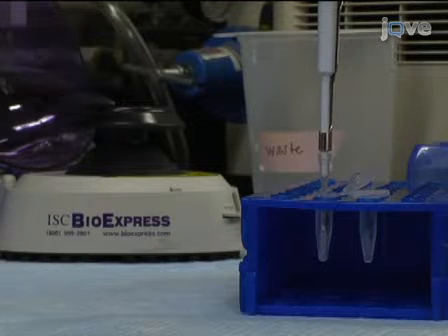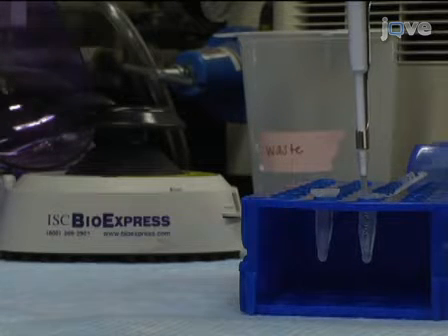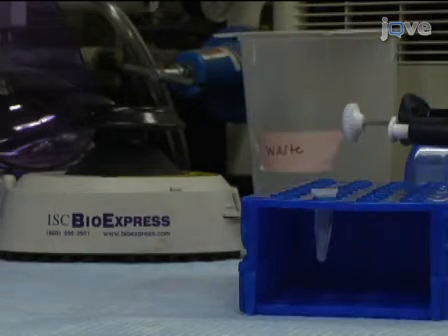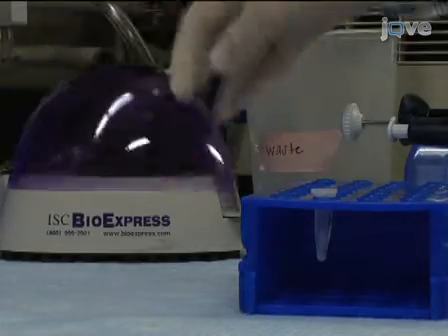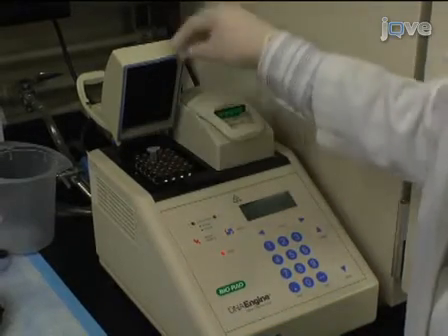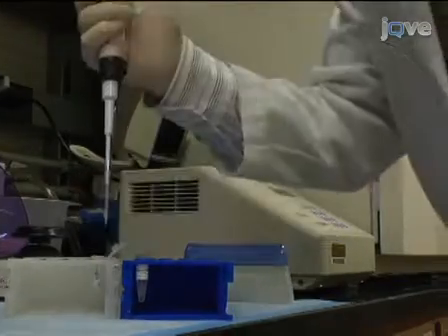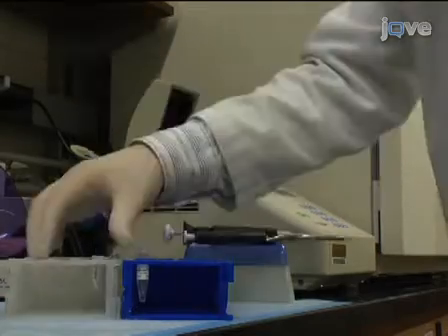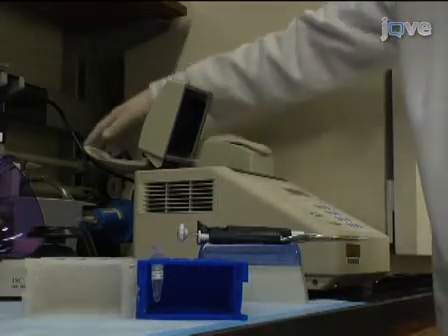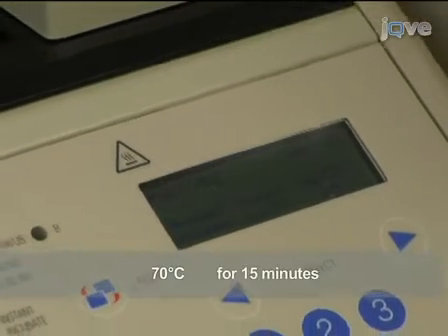After cooling, combine the buffer master mix with the RNA primer mixture. Mix gently and collect by brief centrifugation. Next, put the combined sample to incubate in a thermocycler at 42 degrees Celsius for 2 minutes. To start the reverse transcription, add 1 microliter of SuperScript II RT to the tube and mix. Continue to incubate at 42 degrees Celsius for one hour. Terminate the reaction at 70 degrees Celsius for 15 minutes.